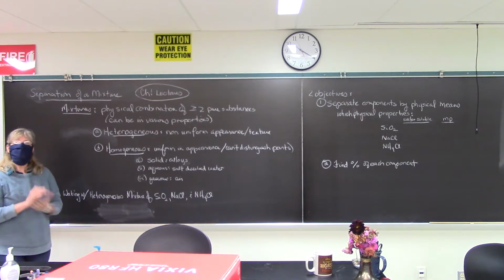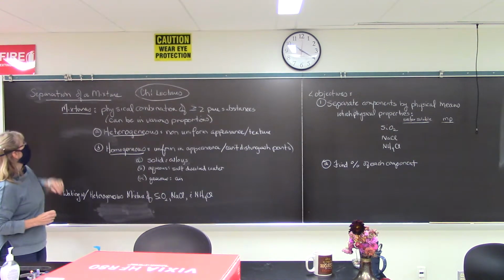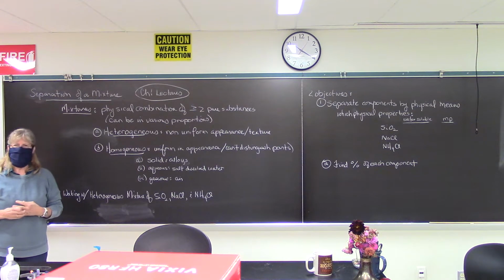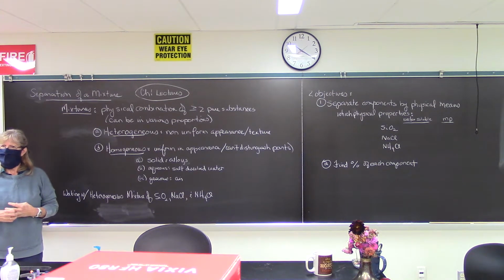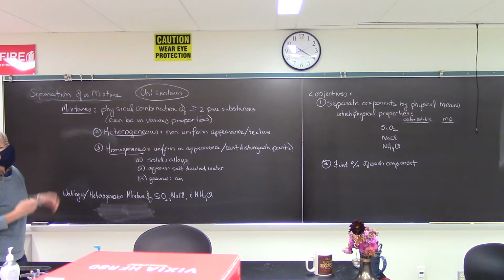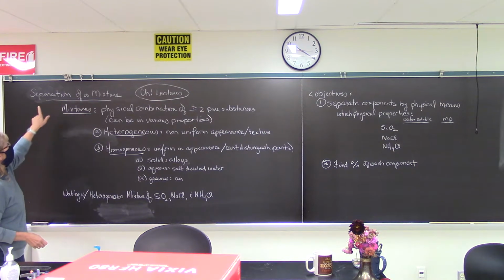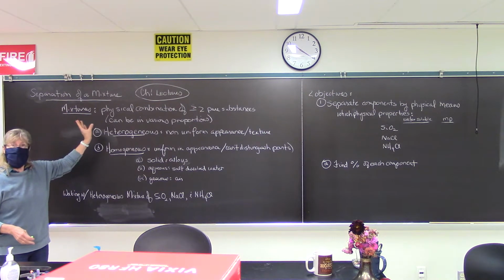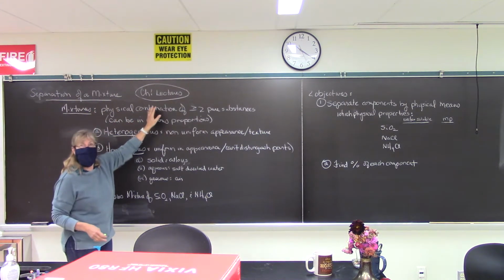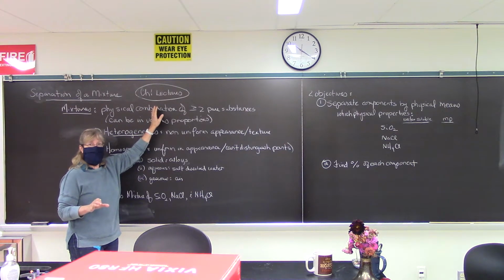Good morning. Okay, we're going to look at the lab for separation of a mixture that we're going to be doing the week of the 21st, I believe. Yes, the 21st. So this is our second in-lab lab, and we're going to be talking before we begin lab about how this ties into lecture. Now, we did mixtures. We talked about mixtures in Chapter 1 lecture.